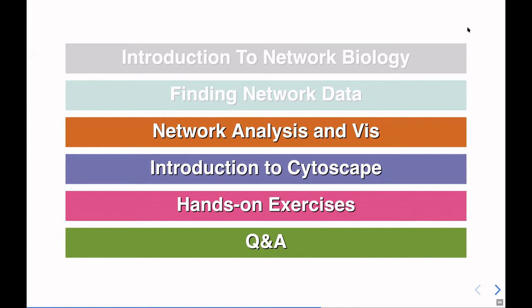Thank you. Sometimes when you put in the names of the genes or proteins, Cytoscape doesn't recognize your names. Do you recommend any conversion tools for IDs? Well, ID Mapper, and there's a number of different conversion tools.